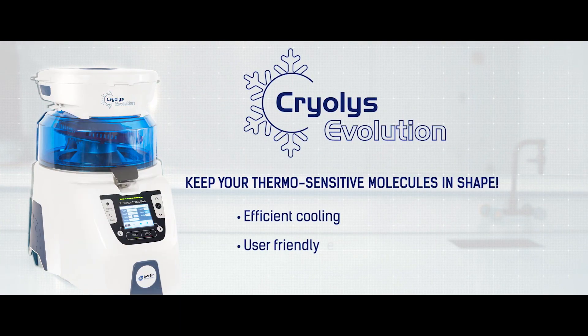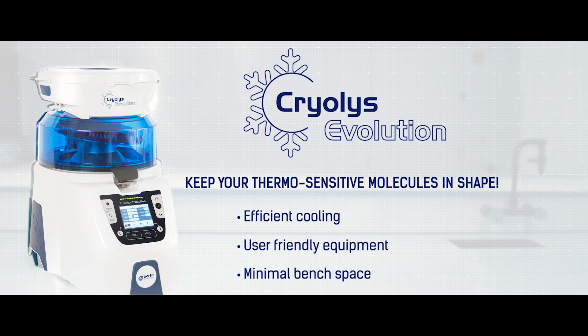Pressilis and Cryolis Evolution, the best solution to keep your thermosensitive molecules in shape.